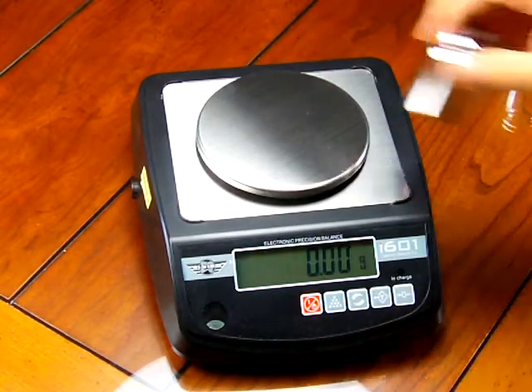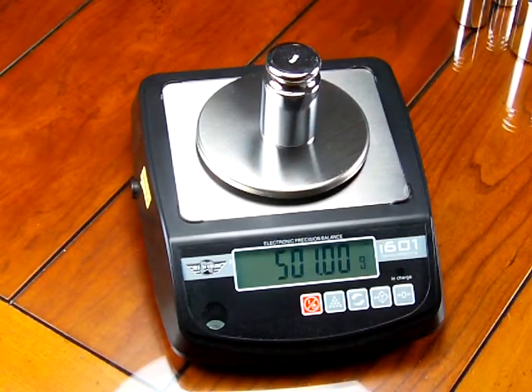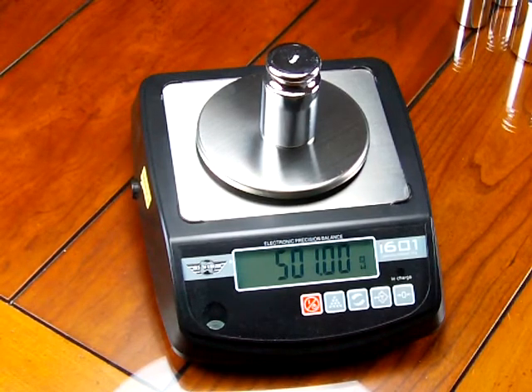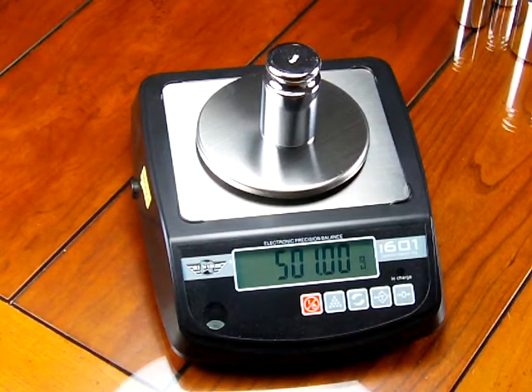If I take the weight off, put it back on again, 500.1 grams. So the scale is very precise. It is not very accurate. Just a technical word I wanted to go over the difference between precision and accuracy.